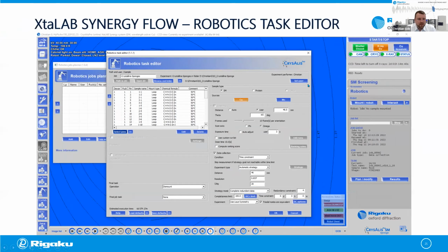Then I want to show you the interface, how you plan a certain robotic task. So you tell CrysAlisPro which pins to be selected. So, for instance, I would say, please, of my full puck, puck 1, I want all pins. You see it incorporated the type of mount that I had. And then you just have to choose, do you either want to run this instrument in a small molecule mode or in a protein mode?